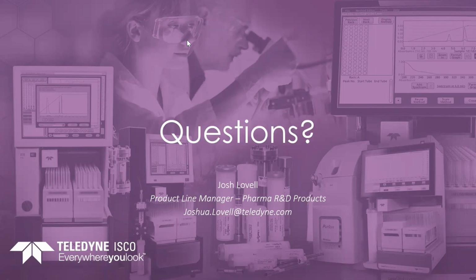Hypothetically, if the compounds are coming off late enough that they don't start coming out until about 85% or so, that gradient from 5 to 85% is not really contributing to any baseline separation of your compounds and your close impurities. And so that's somewhere you can save quite a bit of solvent. You're not going to save as much organic solvent at that point. You're going to be saving more water, and you're going to have a faster method. But that's one way that you can shorten your method time: by optimizing that initial gradient.